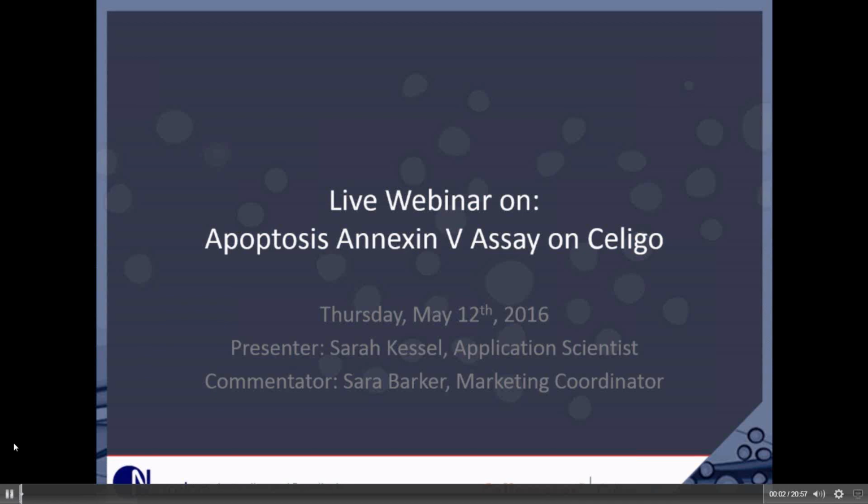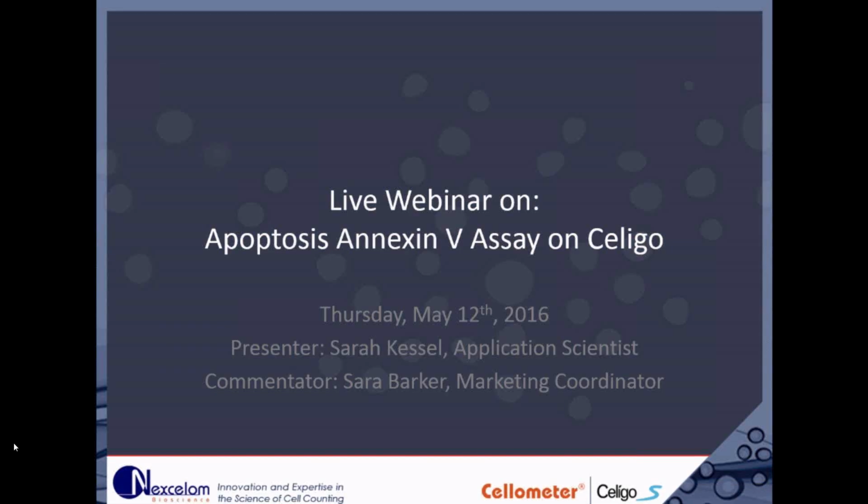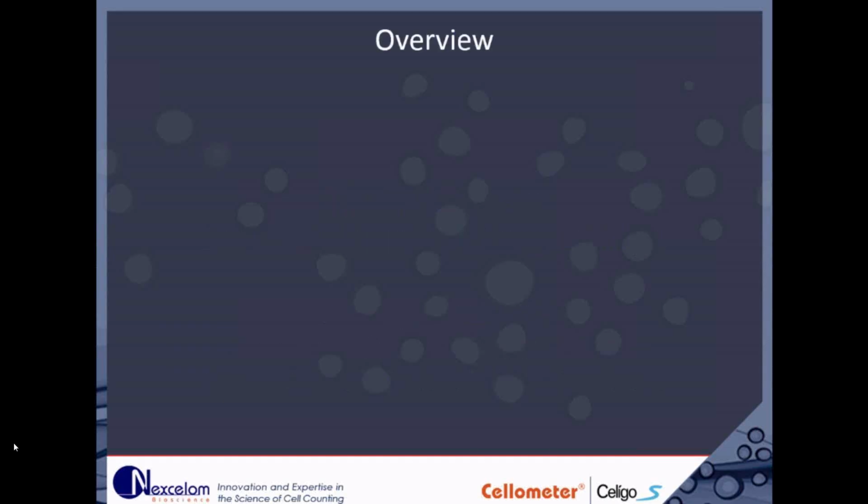Today we're going to cover the Annexin 5 assay on Celigo. There's a lot of people doing the apoptosis assay in communities like immuno-oncology, and I figured this was relevant to bring back into our webinar session if this is something that interests you.